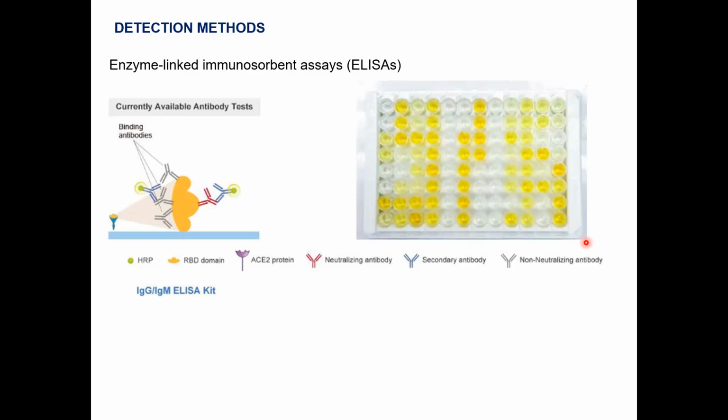So today I'm going to show you one of my results in which I was using a standard ELISA method, a sandwich one. In my case, a higher absorbance means a higher value regarding the protein of interest. In practice, what we did was an indirect competitive one. In that sense, if it's empty, it shows that there is a high level of the protein of interest. So now I'm going to show you the other one.